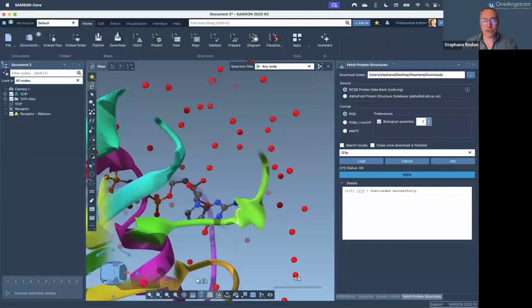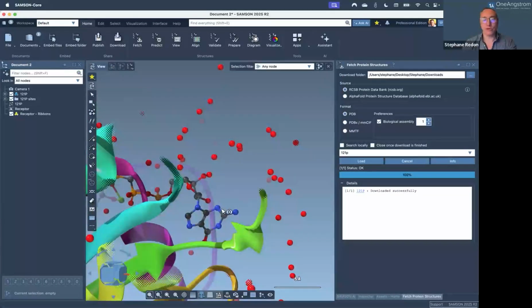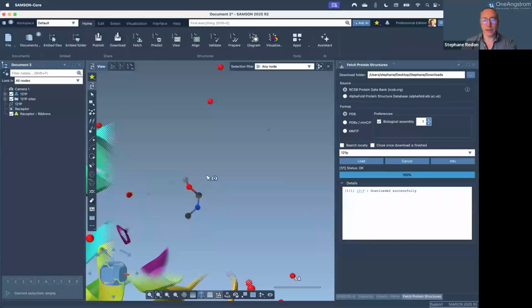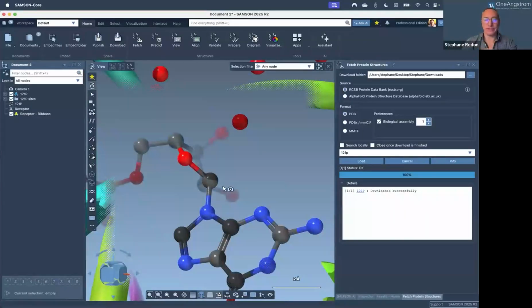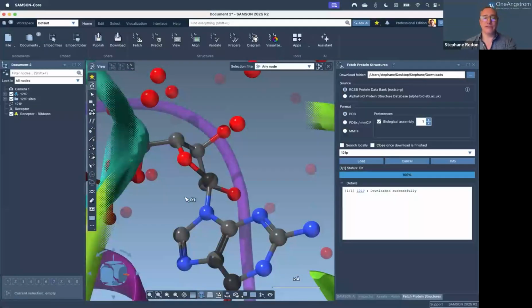And if you want to adjust the fog distance with a shortcut, use the Shift key, so that if you press Shift and Command or Shift and Control at the same time, basically you adjust the size of the viewing slab. For example, when I go down on the trackpad, I have a very minimal viewing slab. And when I go up by pressing at the same time Shift and Command, I have an increasing slab. Using this, you can very rapidly control what you view and make images rapidly.